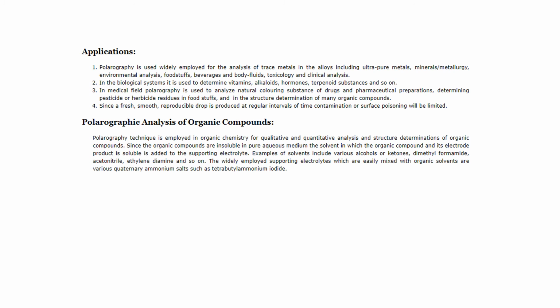The polarography technique is employed in organic chemistry for qualitative and quantitative analysis and for structure determination of organic compounds. Since organic compounds are insoluble in a pure aqueous medium, a solvent in which the organic compound and its electrode product are soluble is added to the supporting electrolyte. Examples of solvents include various alcohols or ketones, dimethylformamide, and so on.